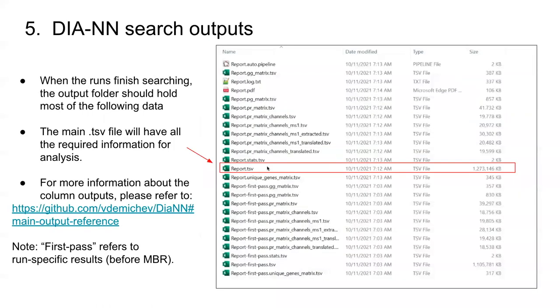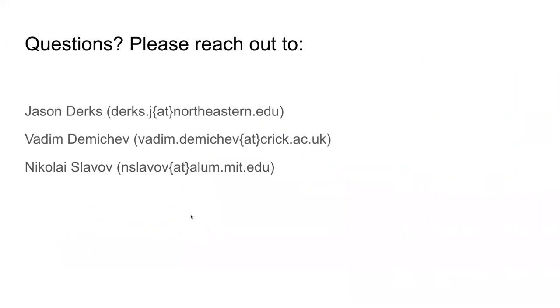Your output is going to look something like this. If it says first pass, that means this is before MBR. If it doesn't say first pass, this is after MBR — and that's really the file you'll want to use most, as it has basically all the information you'd want. If you're confused about some of the column names, I really recommend going to Vadim's GitHub — it's a great resource for basically everything Diane.